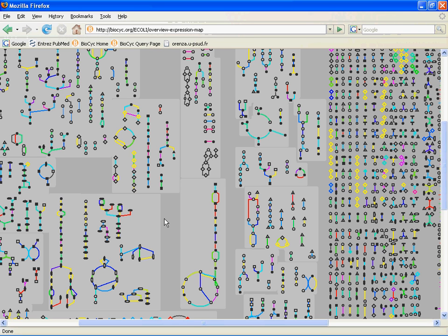You may not want to set the cutoff as low as I did. If you're looking at something where you know that you get a 3.5 log unit swing in at least one of the values, maybe you set all of your cutoffs to 3.5 log units so you can compare. And you'll see that the software does that automatically when we do an animation, which I'll show you in a bit. But now let's go back and look at one other way that we can set the colors, and it's my personal preference.